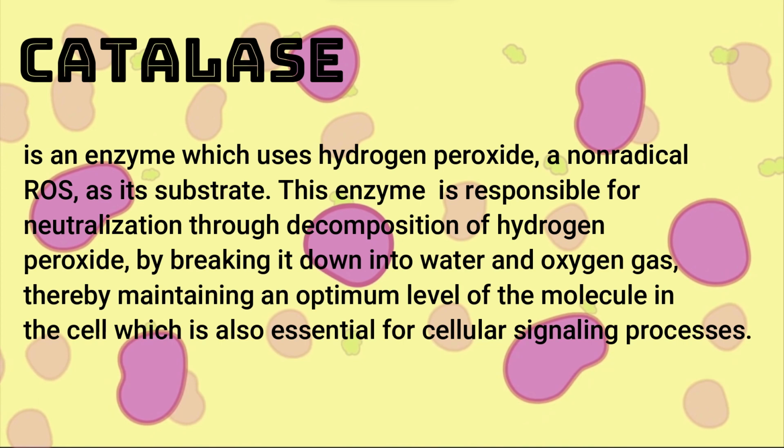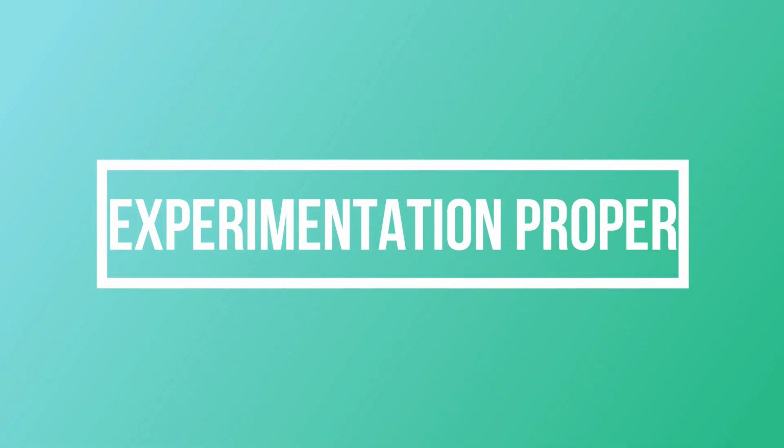This enzyme is responsible for neutralization through decomposition of hydrogen peroxide by breaking it down into water and oxygen gas, thereby maintaining an optimum level of the molecule in the cell, which is also essential for cellular signaling processes. Now, let's get into the experiment.